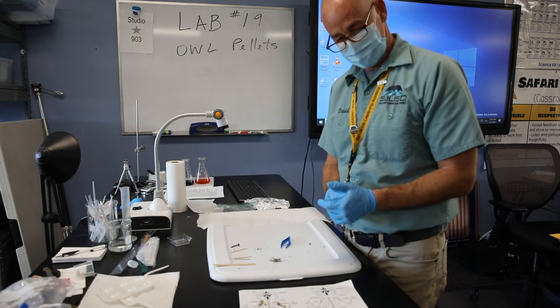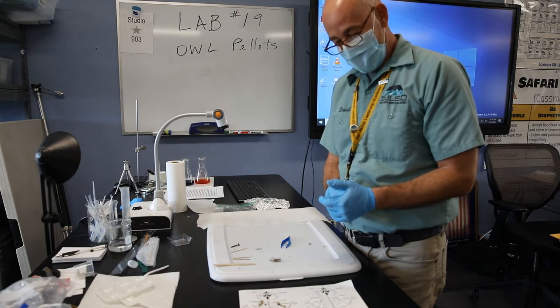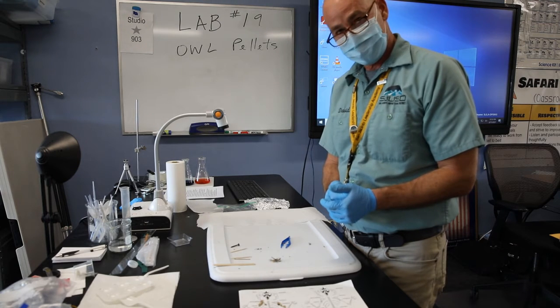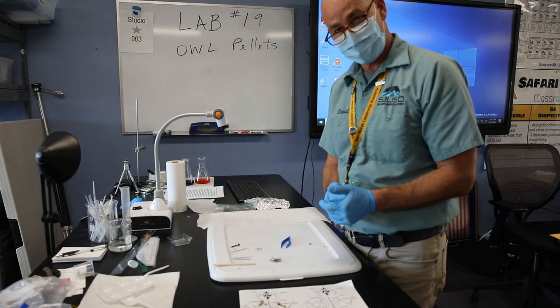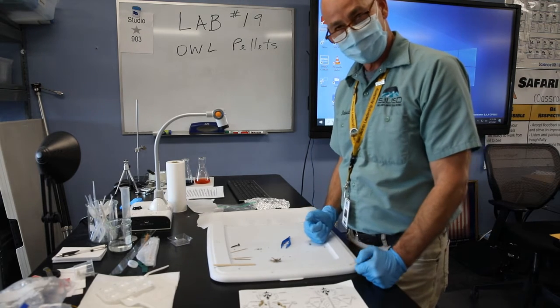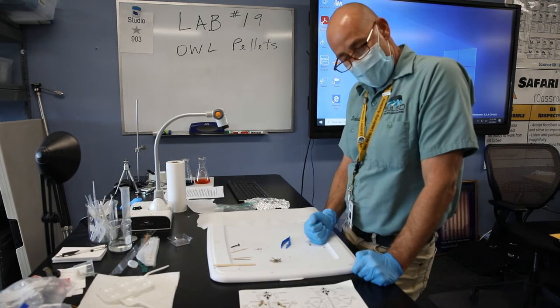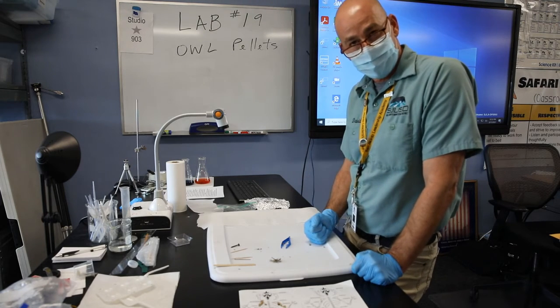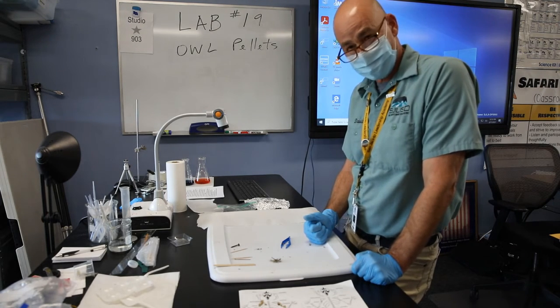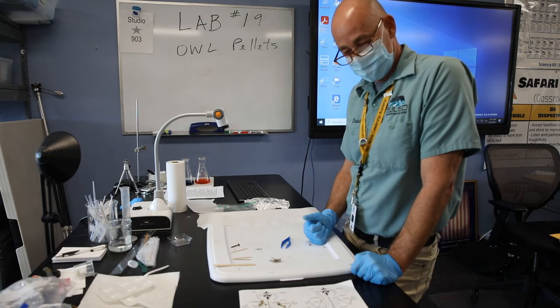And if you can, tell me what kind of animal this owl ate that day. You can tell what the owl ate. And then if all of us turn in what the owl ate, we'll have a sense of what these 30 owls or these 40 owls ate in one day. Okay? So we'll compare our notes and we'll add up all the different types of animals these owls ate. So take a picture of what you found.